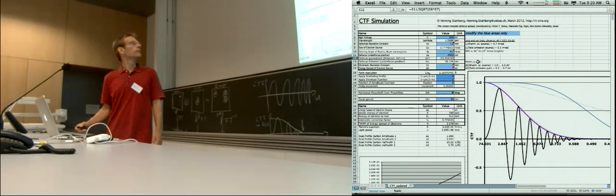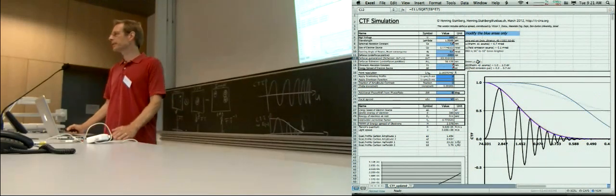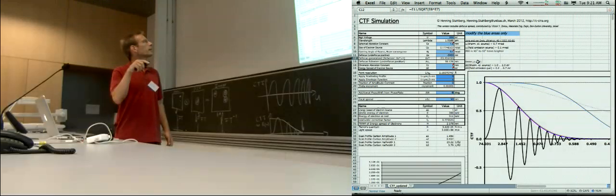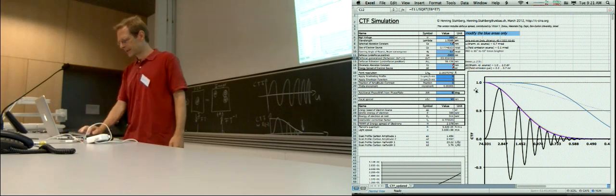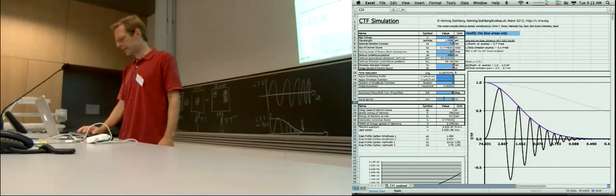On your Excel sheet, is that autofocus part? Yeah, there's somewhere in the version. So this is a version of this Excel sheet that actually Victor Tsenou from the Ben Gurion University modified, and he must have inverted the contrast. But what he put in is the defocus spread, the focal spread here. And so if your objective lens or if your sample has some variations, I did not have this. This is why I use his version. So usually this would be my version, but it's slightly different anyway.